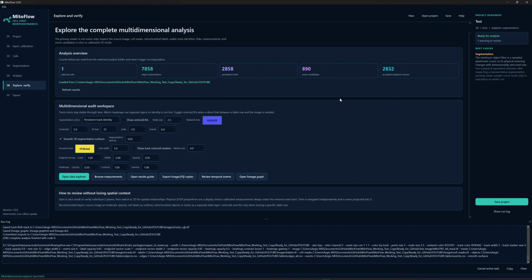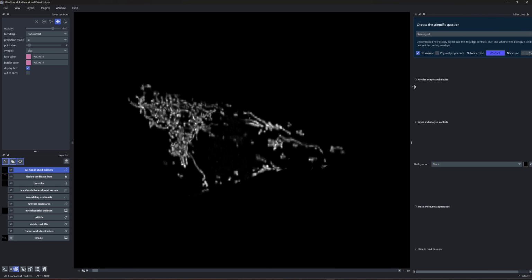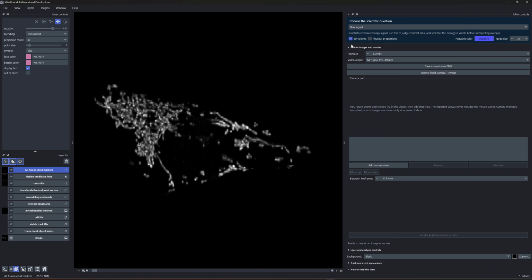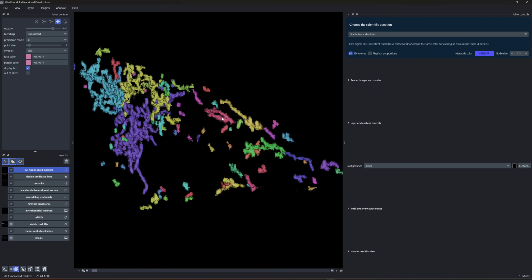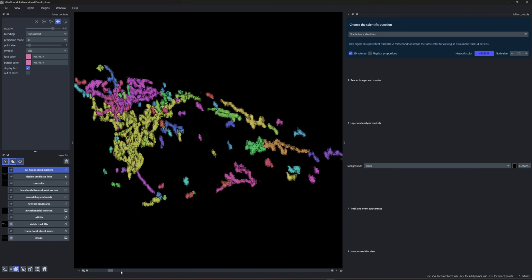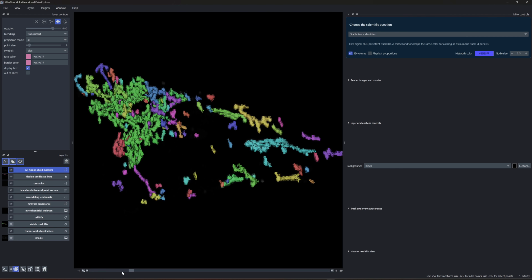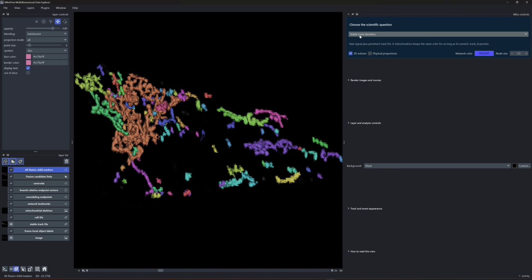And this is the part of MitoFlow that I really like for myself. I really am a visual person. I wanted to see what was happening and how I could verify fission and fusion events manually by actually seeing things happening. So here's the raw, and then I'm going to move on to the stable tracks. So now these are the stable tracks. Anytime a mitochondria changes and merges into another one, the color changes. Okay, so all these things that you're seeing here that are changing the colors, there's an event happening, either fission or fusion. The color change is representative of that event. It's a quick at-a-glance sort of thing.